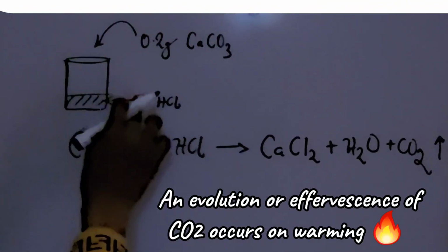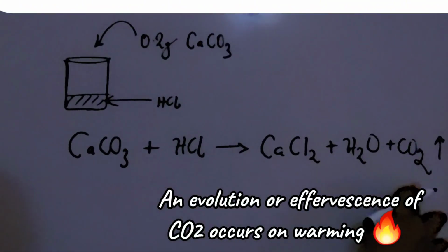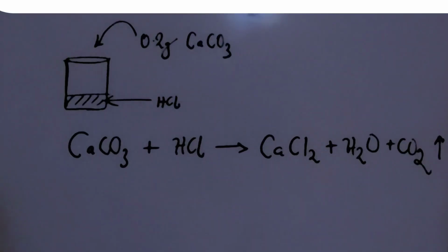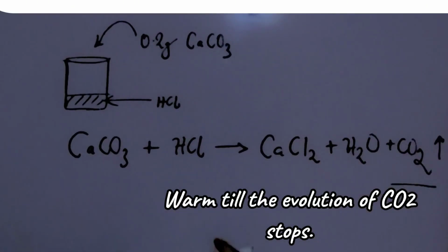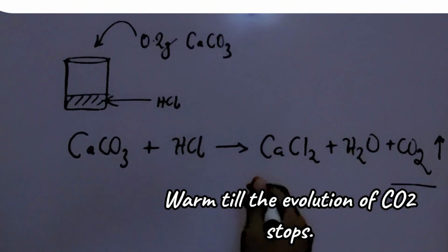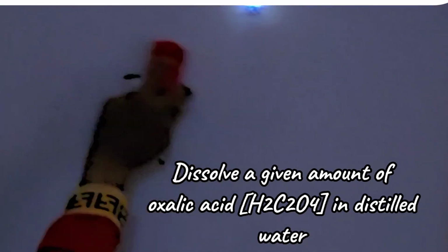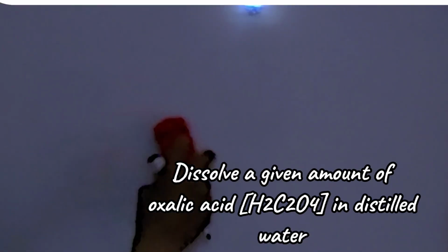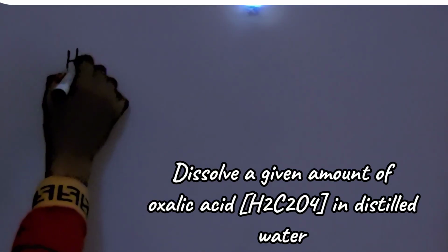Once you've added the calcium carbonate into the given volume of HCl, this reaction happens. Now effervescence will be observed, which is due to carbon dioxide being released. Once you've observed that the effervescence of the carbon dioxide has stopped, you would now introduce the oxalic acid.